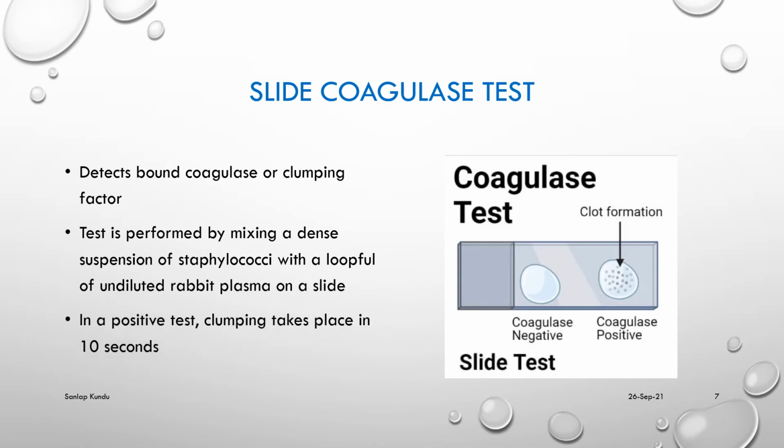In a positive test, clumping takes place within around 10 seconds. Here you can see on the slide, in case of Coagulase-positive Staphylococci, there will be a clot formation.